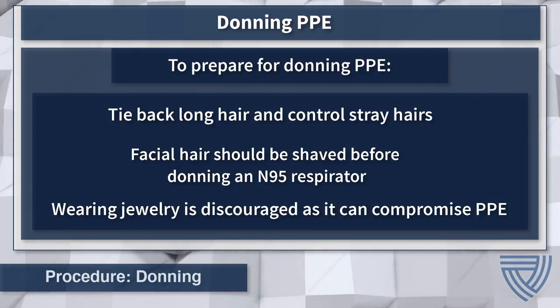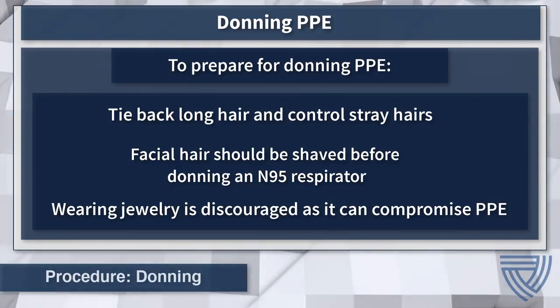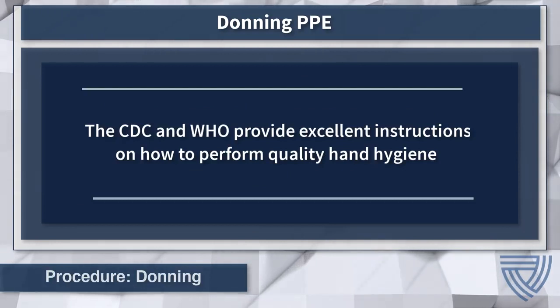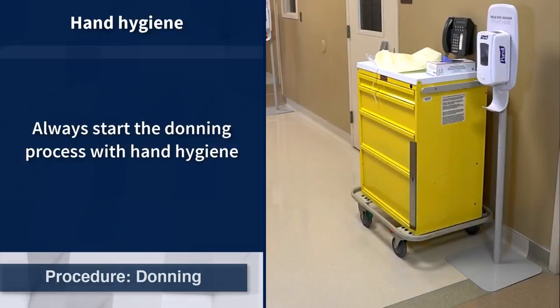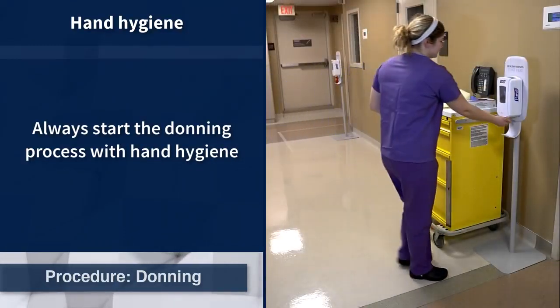Wearing jewelry is discouraged as it can lead to breaches in infection control and PPE. The CDC and World Health Organization both provide excellent instructions on how to perform quality hand hygiene. The links to these resources can be found in the information below.